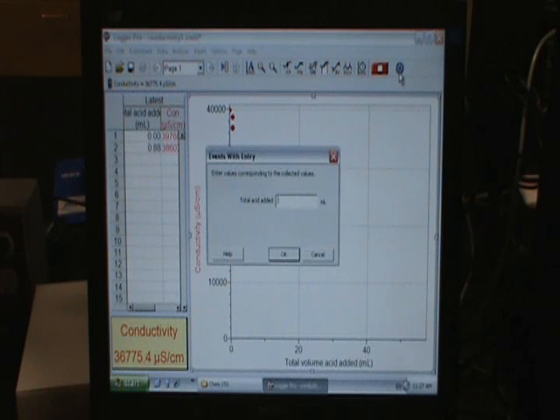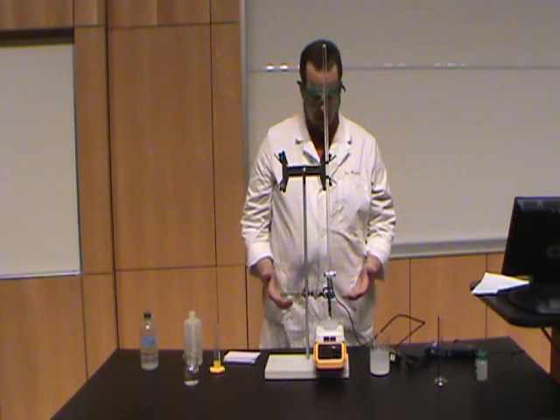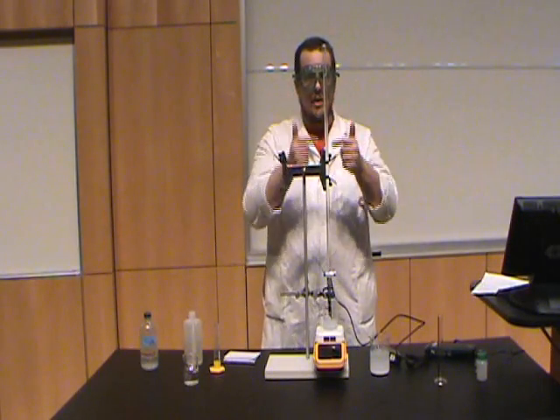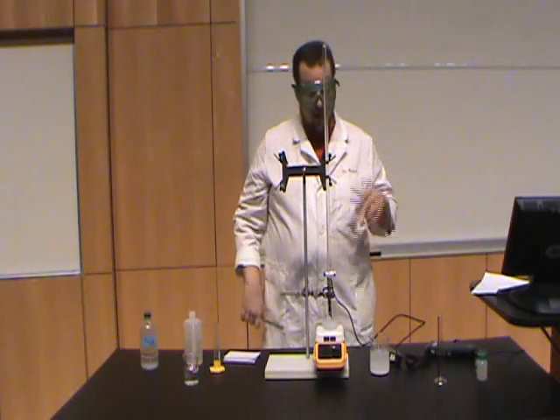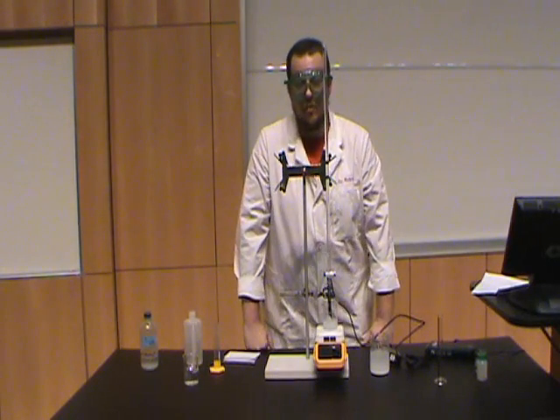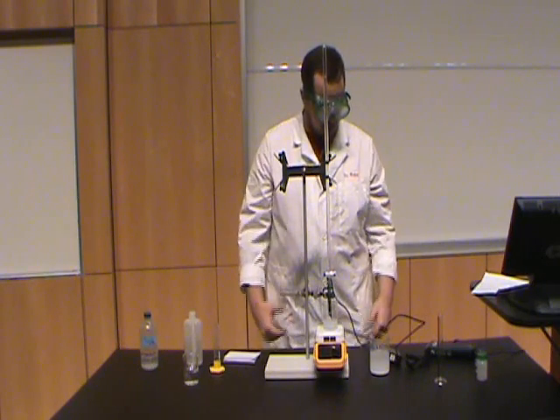Again, click keep. And I've added 1.79 milliliters. And that's the experiment. We're going to keep adding about a milliliter at a time. We're going to keep track of the total that we've added. The computer's going to keep track of that for us to some extent as well. And we should be in good shape.